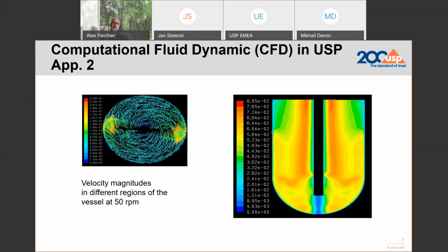And what's interesting, if you look at the bottom of the shaft where it is blue, this is a zone where actually not much in terms of hydrodynamics is happening, which is where you usually have your tablet, your capsule, or whatever is placed underneath the paddle.